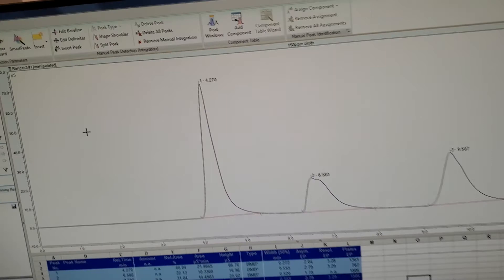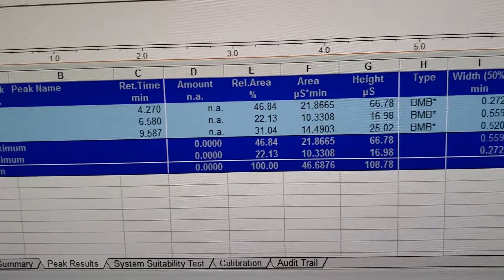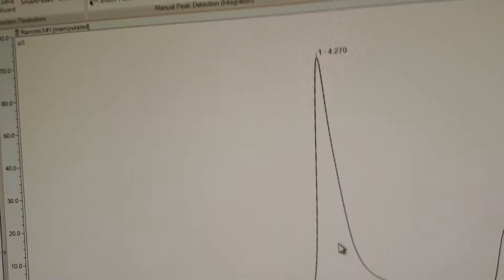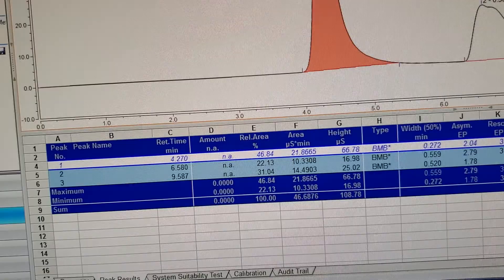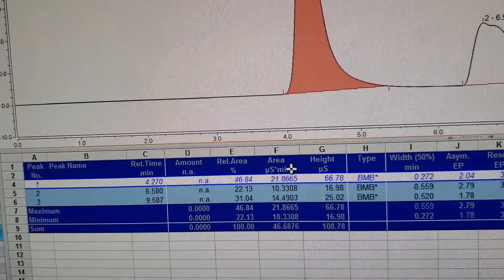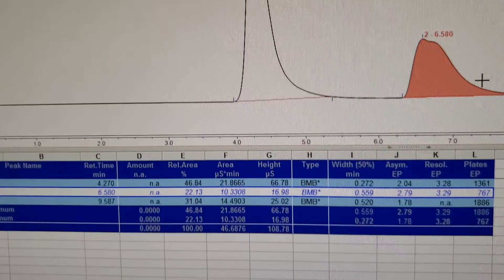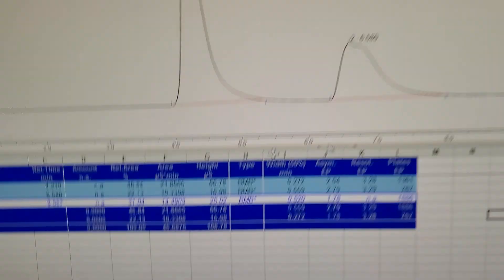Go back to clicking on the automatic, then click under the curve you want to check. Your results will be under the injection number—for example, this first injection is under number one. You can see the area right here. You can always switch between your curves and it'll tell you each one. You have all three of these individually right here. Perfect. Thank you.